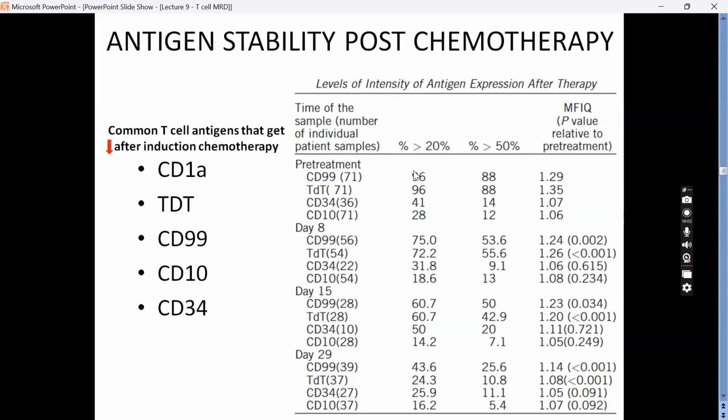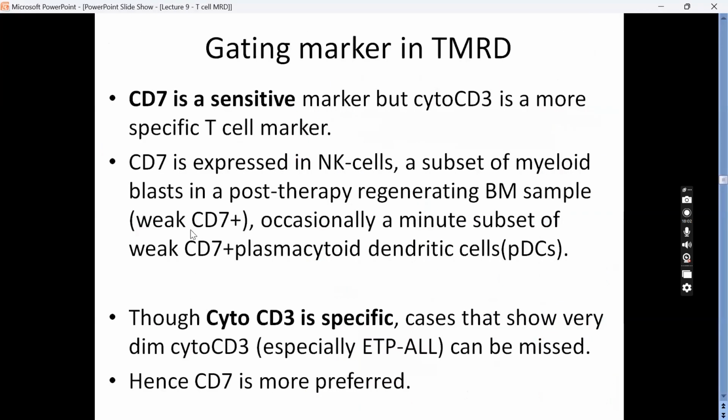Okay. Now, in contrast to all these maturation patterns, when you get a neoplastic blast population, you find it is homogeneous, and you see the CD3 expression. This is normal T cells. CD3 is downregulated. Okay. So that's a sign of immaturity. And similarly, 4 and 8 double negativity is a sign of immaturity. And you find the controls here. CD8 positive normal T cytotoxic cells. CD4 positive normal helper cells. And again, CD45 is slightly lower. And as I said, CD3 is weaker. So these are all signs of immaturity.